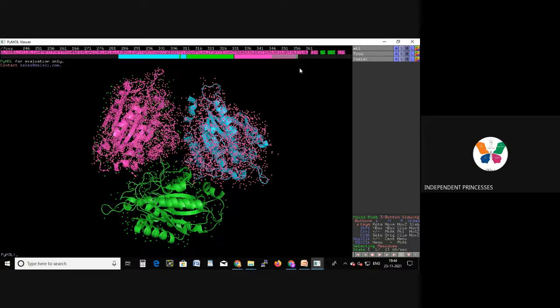It depends upon the best fit. If all of them fit by the same method, then you are going to choose only one, and the remaining two you are going to keep in another place, right? Here also we are doing the same thing. We are not taking all 3 proteins.